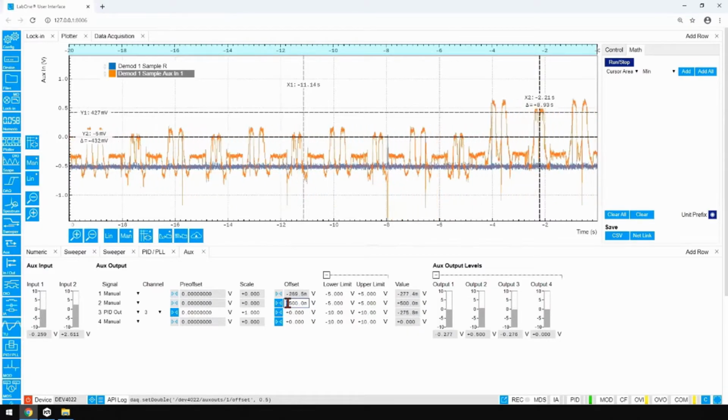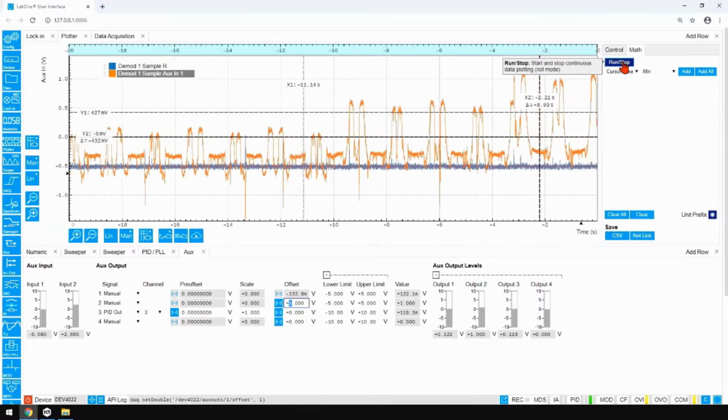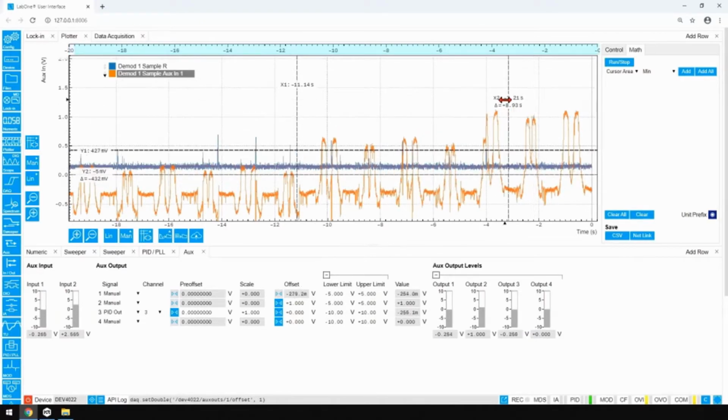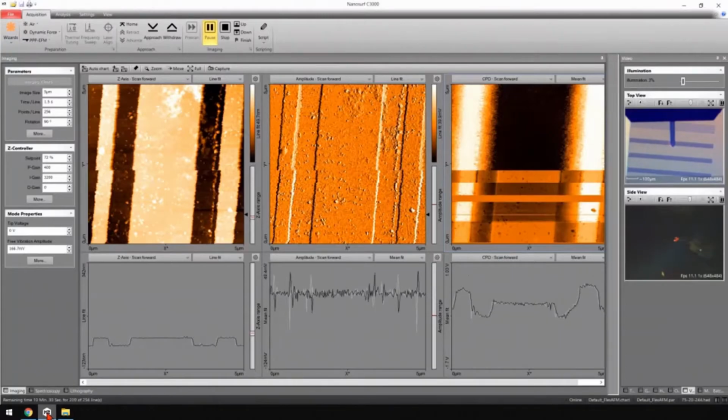So here I'm starting with half a volt and with 1 volt. And just for the sake of consistency, let's make sure that this is more or less what is applied. Here we had our gold strips before and after applied about 500 millivolts. That's what you see here. And if I do it between here and here, I again have close to 500 millivolts. So that's consistent, and that's what we would expect. So if I return here, that's what we see as well.